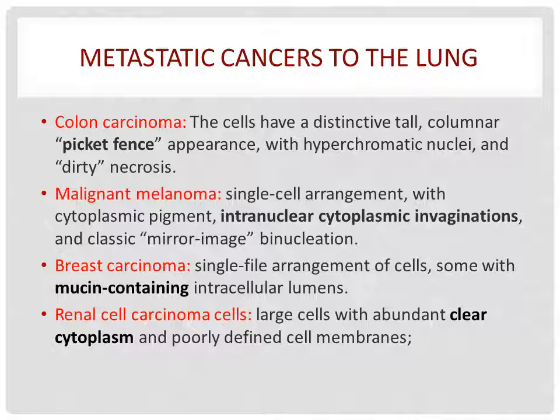Next is metastatic cancers. Metastatic cancers commonly originate from breast cancer, colon cancer, renal carcinoma, bladder cancer, and melanoma. Here are some cytological characteristics: for colon carcinoma, the characteristic is palisading; for melanoma, intranuclear cytoplasmic invagination; for breast carcinoma, mucin-containing intracytoplasmic lumens; and for renal cell carcinoma, abundant clear cytoplasm.